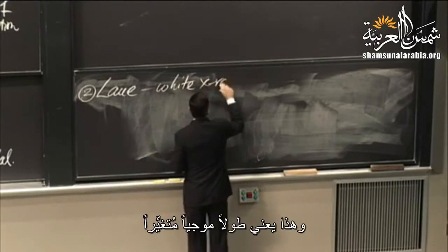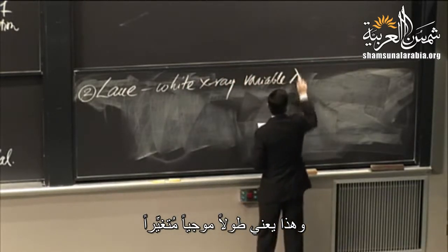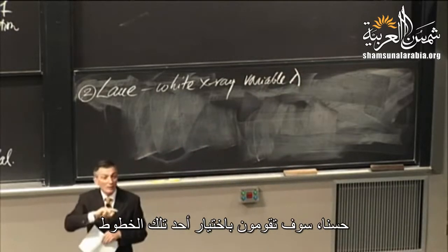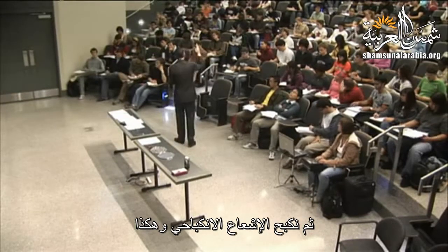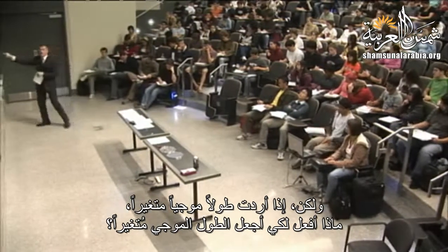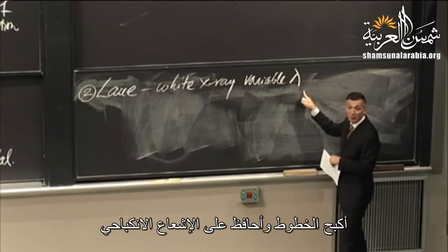White X-rays. That means variable lambda. So how would you get a fixed value of lambda? Well, you'd pick off one of those lines, like maybe the K alpha line, because it's a nice singular line, and repress the Bremsstrahlung and so on. But if I want variable lambda, where do I go for variable lambda? I repress the lines and I go for the Bremsstrahlung.